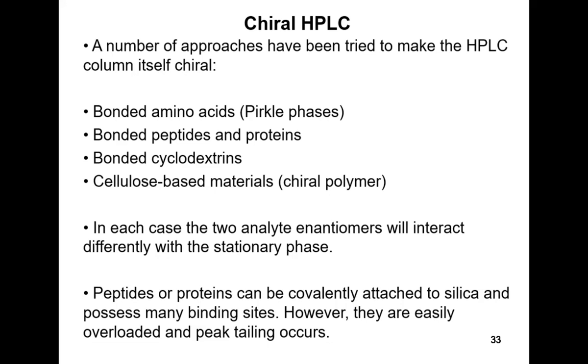I've never done chiral HPLC myself. Or go on, you have? Yeah, I use chiral analysis using SFC actually. I think it's called supercritical fluid chromatography. Okay. So we're not going to be covering that.